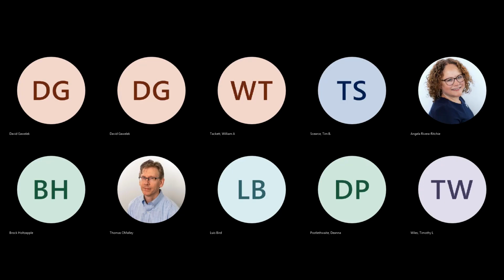I want to leave you with this. This is the landing page. And again, I will send you a link to the landing page and some other information. It's pretty straightforward. The registration process is very quick. The app is available in the Google Play Store and the Apple App Store, and you could get the app up and running within minutes.